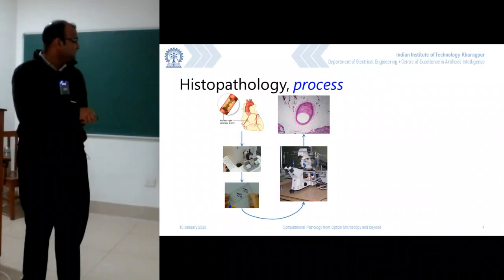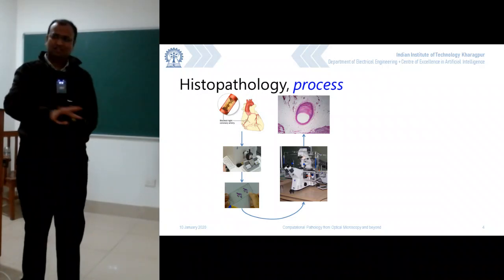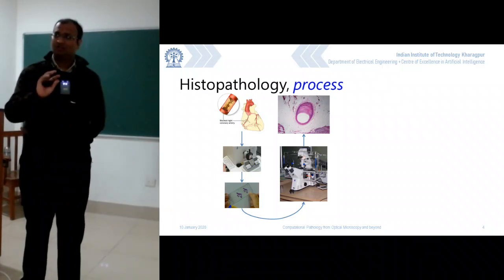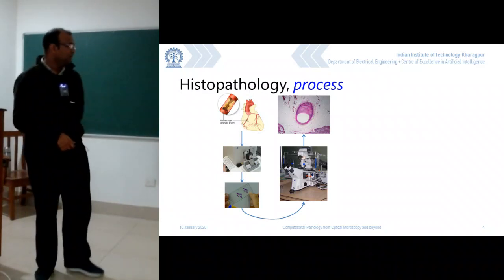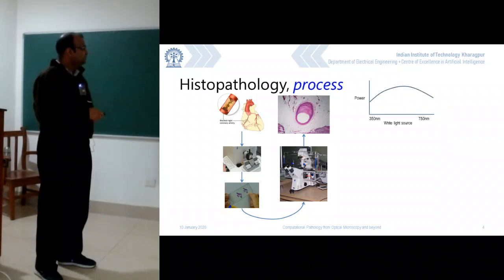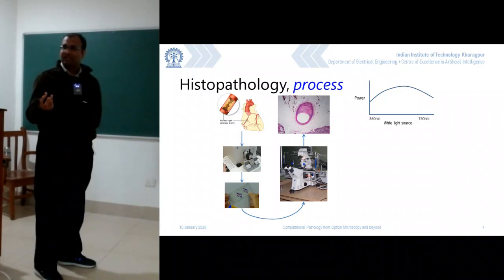So this whole thing is there, but nonetheless all microscopes are almost the same. The only difference comes down in terms of the optics, and we'll come to that. Now once you have this part, then if you look at a systems process, you have a white light box from where light is generated.